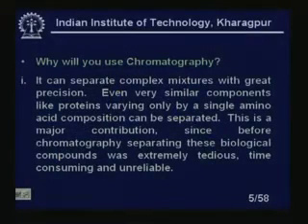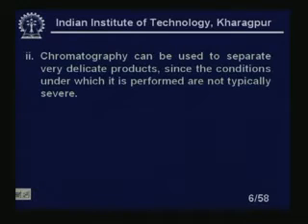This is a major contribution, since before chromatography, separating these biological compounds was extremely tedious, time consuming and unreliable. Chromatography is quite a reliable instrument in that sense. It can be used to separate very delicate products, since the conditions under which it is performed are not typically very severe.